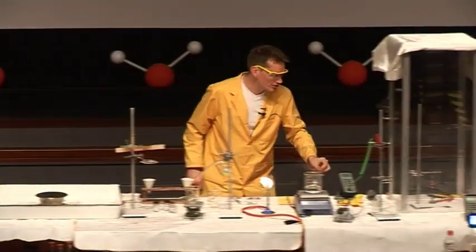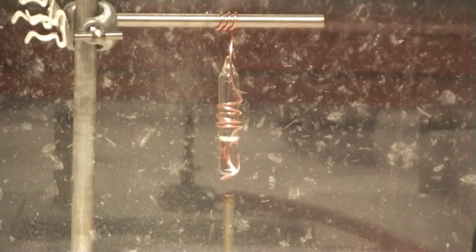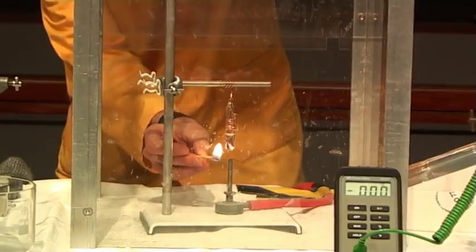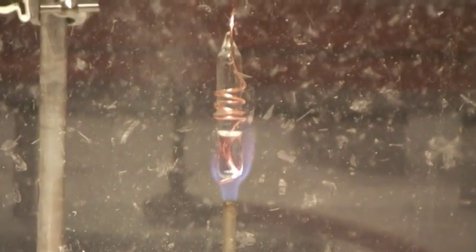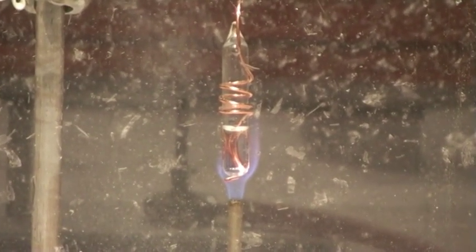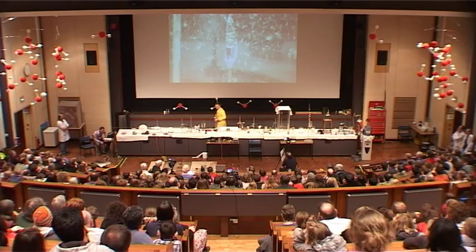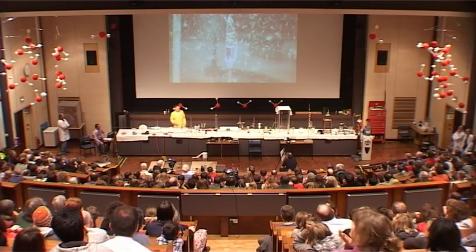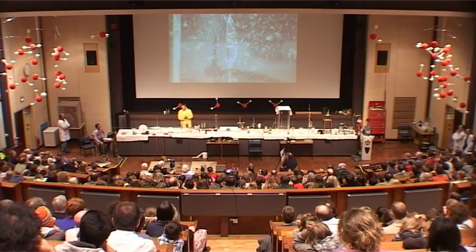But while we do that, I'm going to set up another experiment over here. And over here, we have 1 millilitre of water again, but this time it's in a sealed tube. And I'm going to do something rather silly, and that's heat up this with a Bunsen flame. So we'll keep a camera on this now. So we've got 1 millilitre of water being heated up, but this time it's in a sealed tube, so there's nowhere for the water to escape, and there's nowhere for the steam to escape either. And we've seen that 1 millilitre turns into, well, I think we've lost count now, but it's almost 2,000 millilitres of steam. So we'll just turn this off.